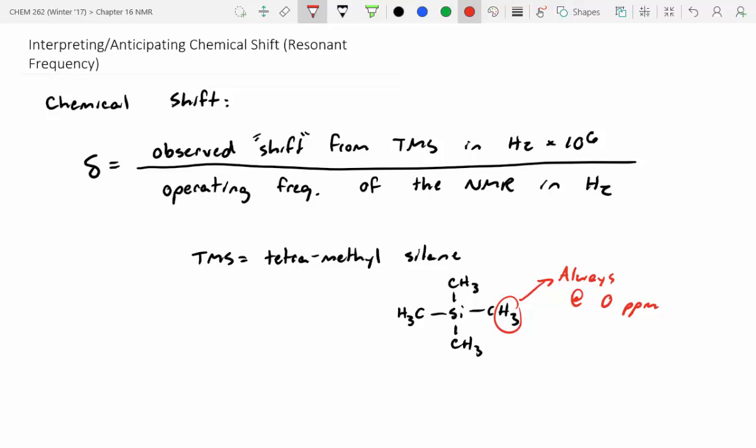Yeah, so if we think about, let's say I want to do my NMR in water, right? All you're going to see is the peaks for the protons on your water as a solvent molecule, right? Because NMR can see protons, but it can't see deuterium atoms. So you want to choose a solvent that has deuterium because it's invisible by NMR. That's the most important thing when you're picking an NMR solvent, is pick something that's NMR silent. So deuterated solvents work the best.